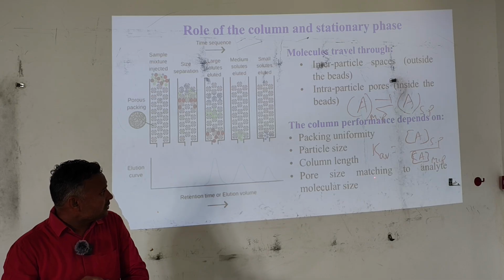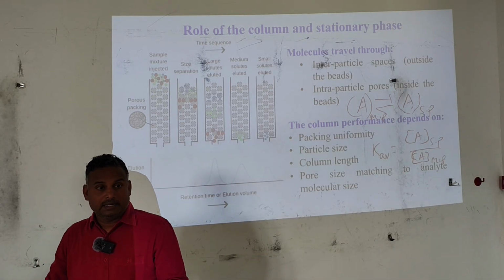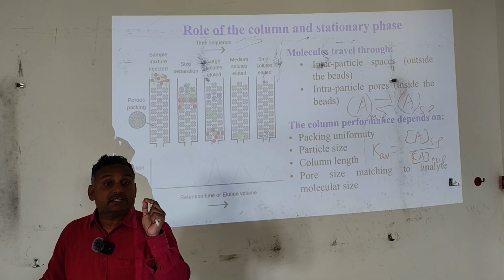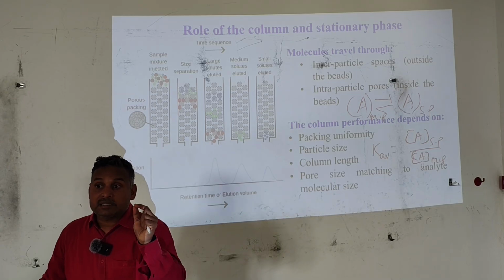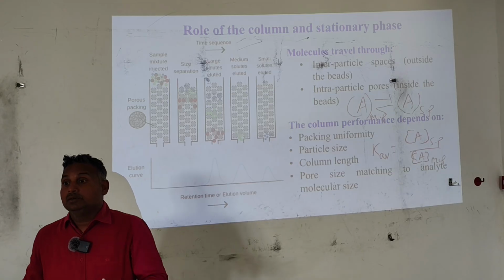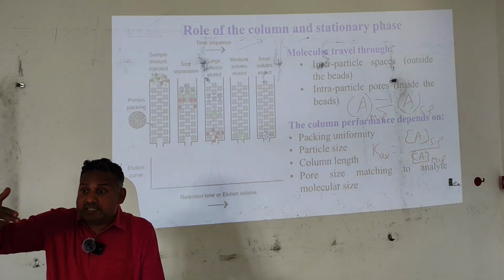Pore size matching to the molecular size. This point is very important. It dictates the selection of the column. As I already told you, there are different stationary phases.